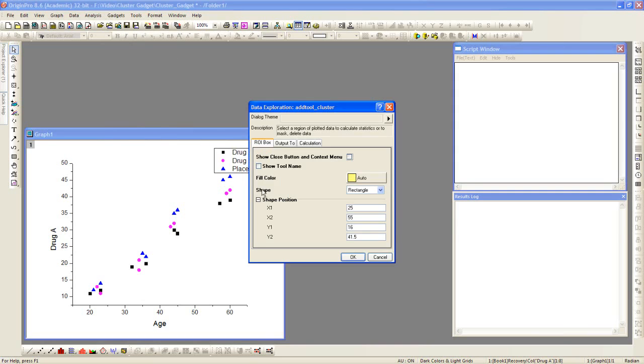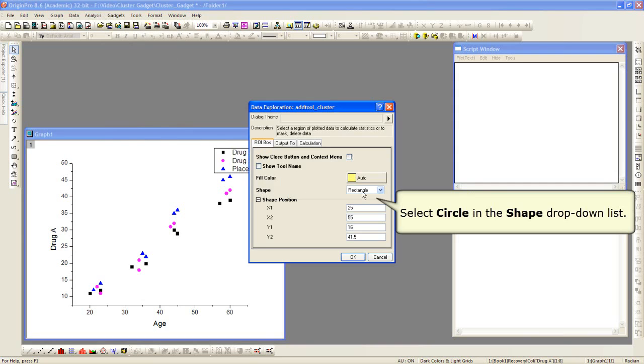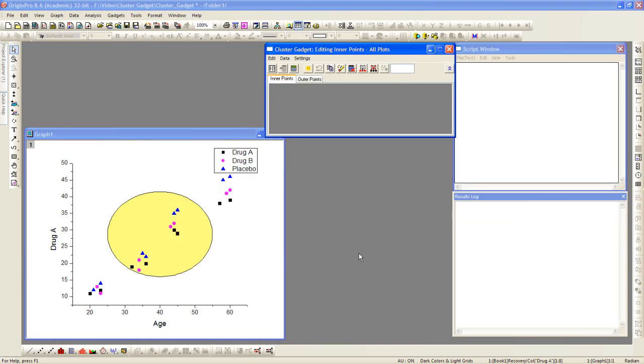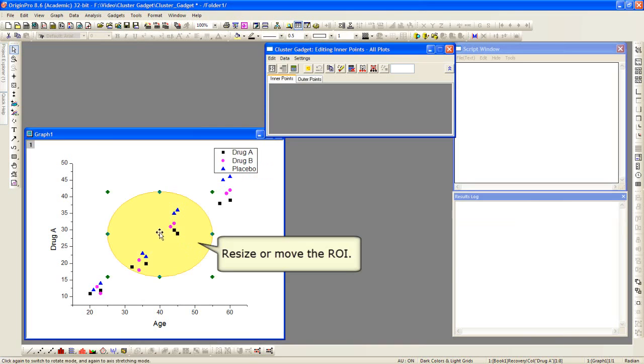The first thing we're going to do is change the shape from rectangle to circle. When we click OK, we're going to see a circle on our graph. This is the region of interest.